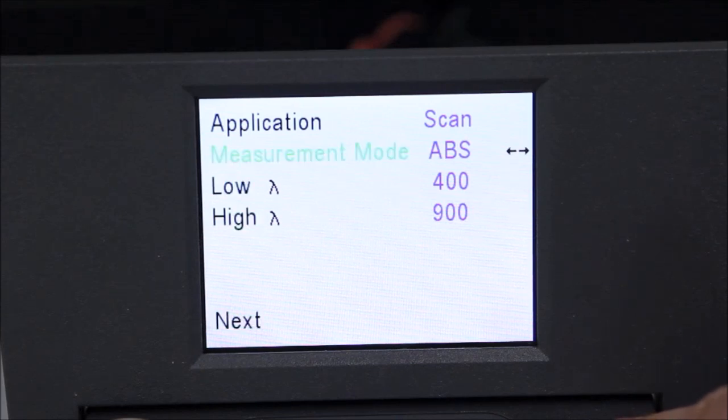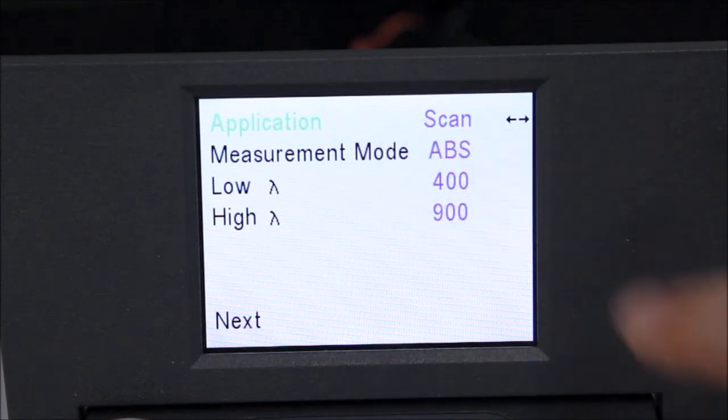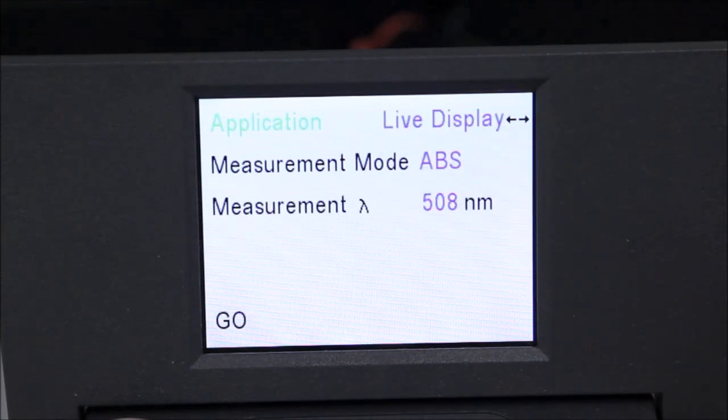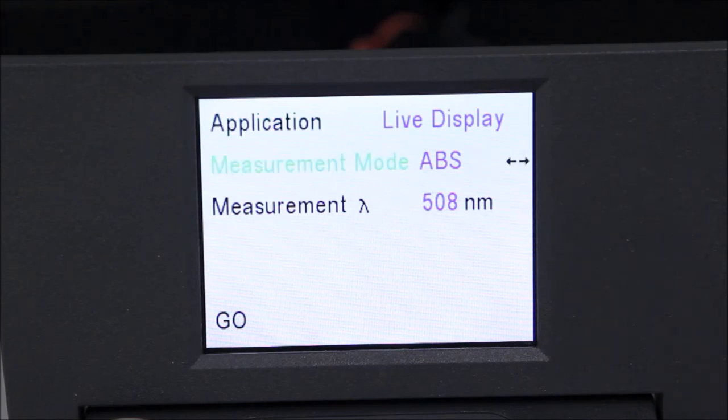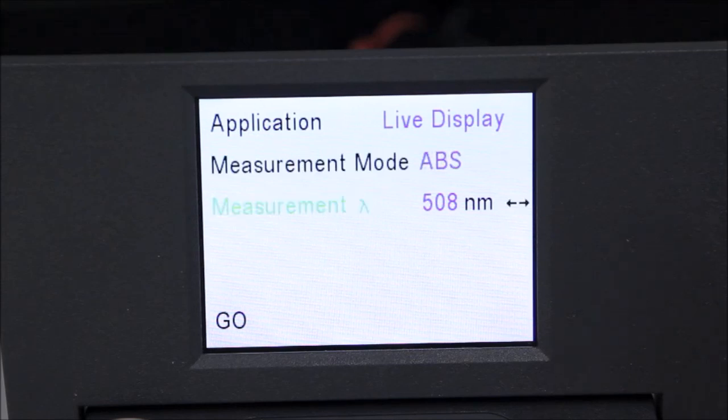Once we know the analytical wavelength for our solution, it is usually best to use the live display application. The live display application will give us the option between absorbance and percent transmittance output, as well as allowing us to change the wavelength if necessary.